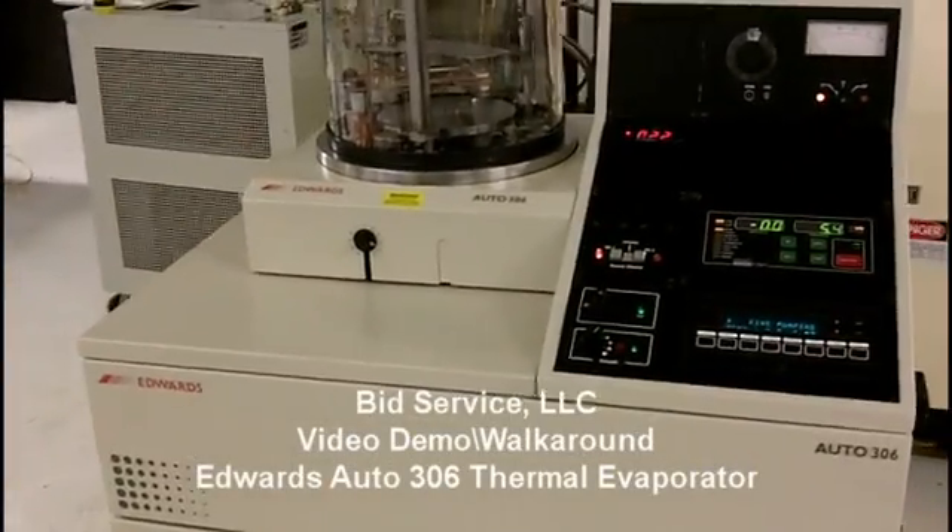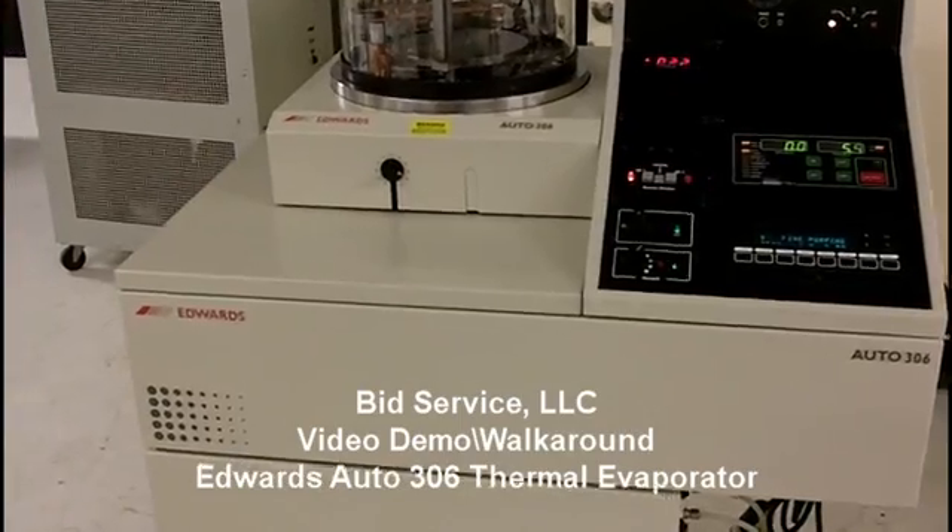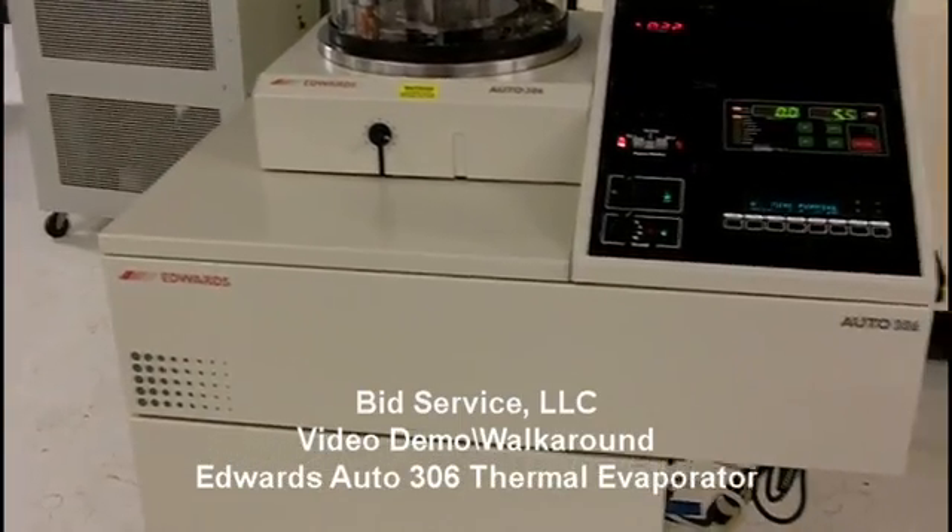This video demo is for the Edwards Auto 306, serial number 3178.